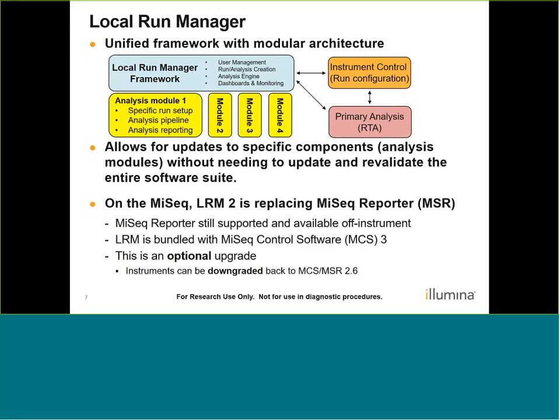Speaking of MiSeq Reporter, on the MiSeq, Local Run Manager 2 is replacing MiSeq Reporter. Currently, MiSeq Reporter is still supported and is also still available off instrument. LRM2 is bundled with MiSeq Control Software version 3, and that update is an optional upgrade. Instruments are still shipping with MCS2 and MSR 2.6, and you can update them to MCS3 if you would like. It's also downgradable back to version 2 if you prefer.